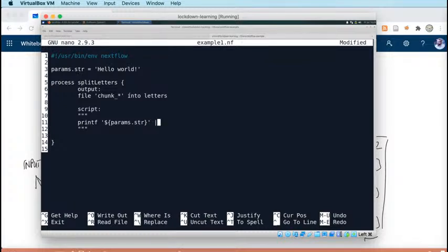So printf prints it into a file handle, and we then pipe the contents of that into this executable called split, which takes the input and breaks it up into chunks. So we're giving it our standard input and we're breaking it up into chunks. I'll show you what split does in a second at the command line. So this will split the input into chunks of 6 bytes. Okay, so we'll get 6 bytes and then 6 bytes. The first 6 bytes of this string is HELLOW space.